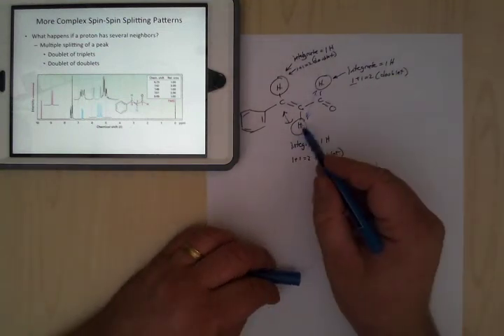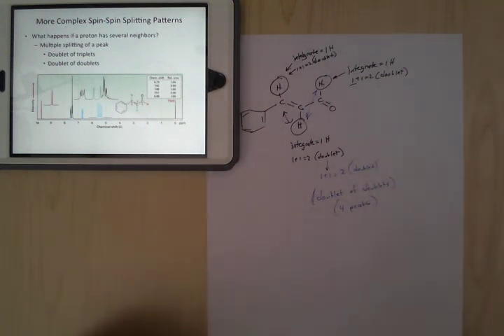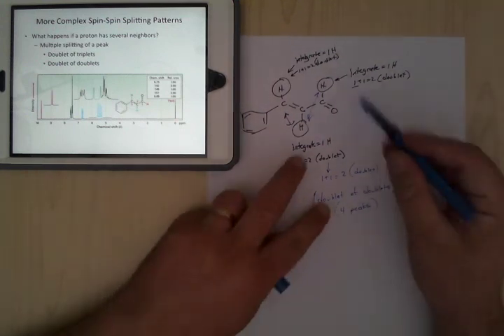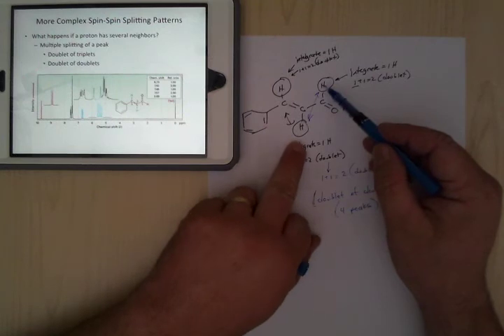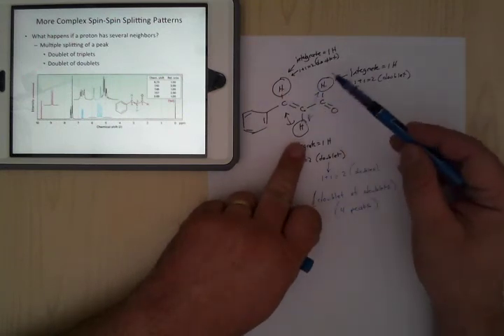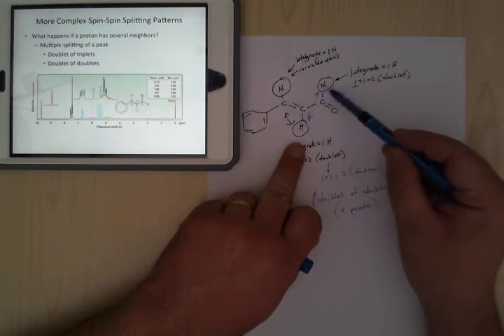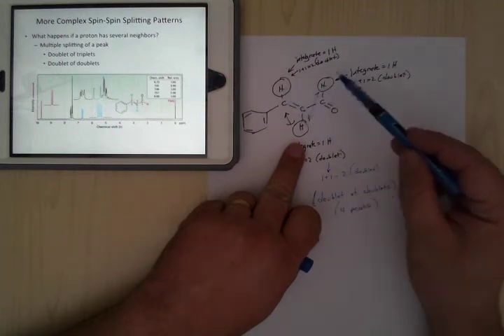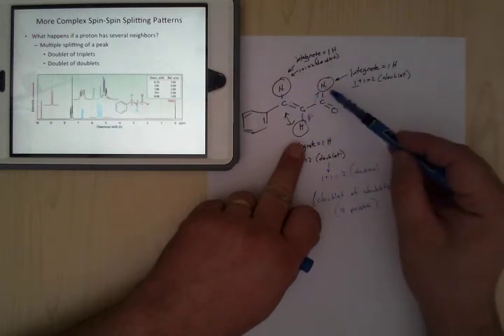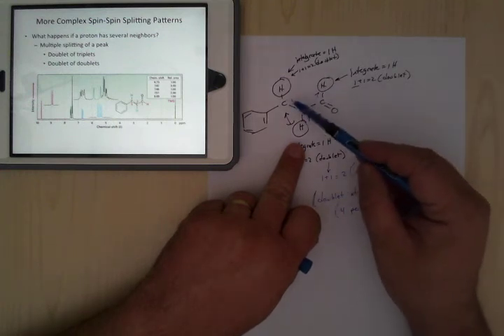for this one hydrogen. And you're going to say, oh, it's a CH3 next to it. No. You have to be careful. If this was a CH2 over here, you would have a doublet from this side split into triplets, or you can have a triplet split into doublets. If this was a CH3 on this side, you would have a doublet, and then it takes those doublets and splits them into a quartet, so it's a quartet of doublets or something like that.